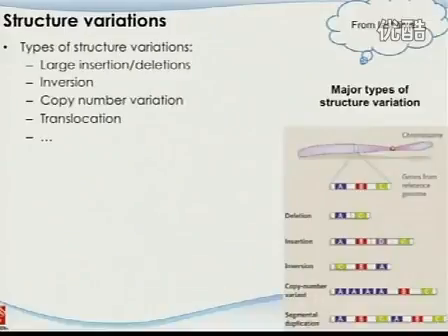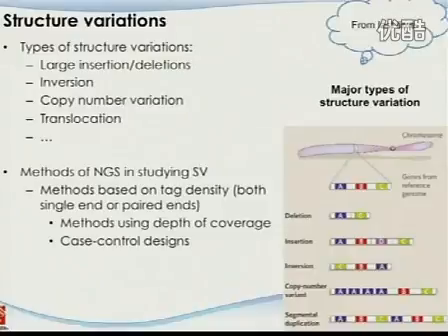And we briefly touched on structural variations. So these are different types of structural variations, and as you can see, what their patterns look like.